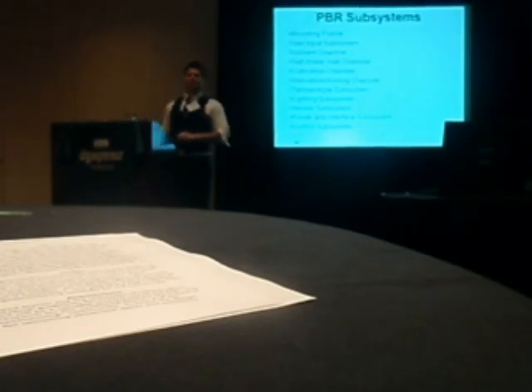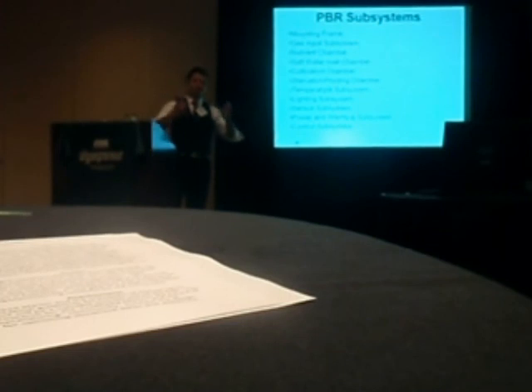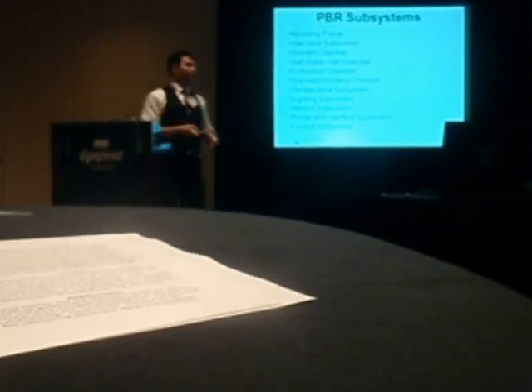So we ended up with our final design. We have these subsystems. Mounting frames, this is basically just a Home Depot style mounting that can be reconfigurable, modularizable, and scalable. And so if you need to put another tank on eventually or more sensors, you can modify it.